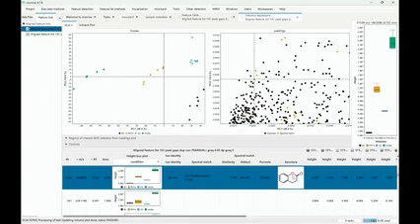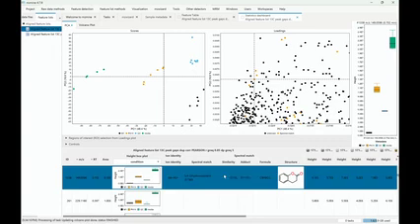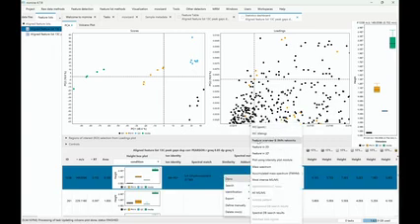And now we have a compound structure, but I'm actually not quite sure how did mzmine come up with this structure? There's, of course, the similarity, there's an adduct, there's the spectral match and so on, but we all would also like to confirm basically the spectral match. In here, from the table, we can right-click and say we want to see the feature overview and ion identity molecular networks. So right-click anywhere in the table and choose feature overview.